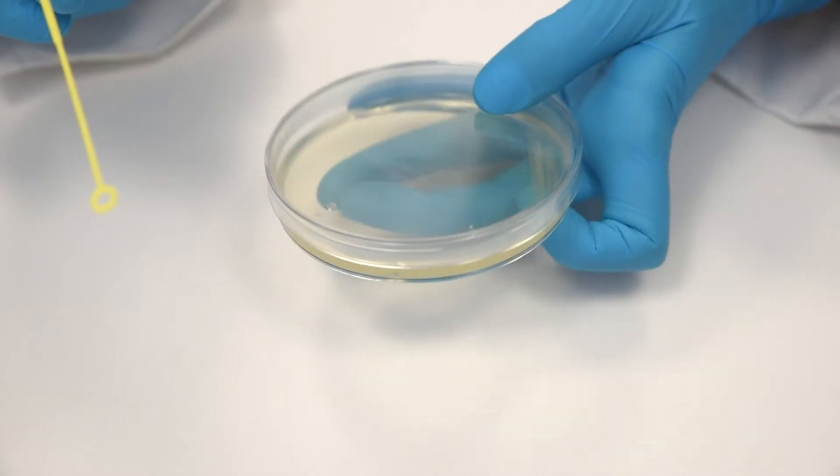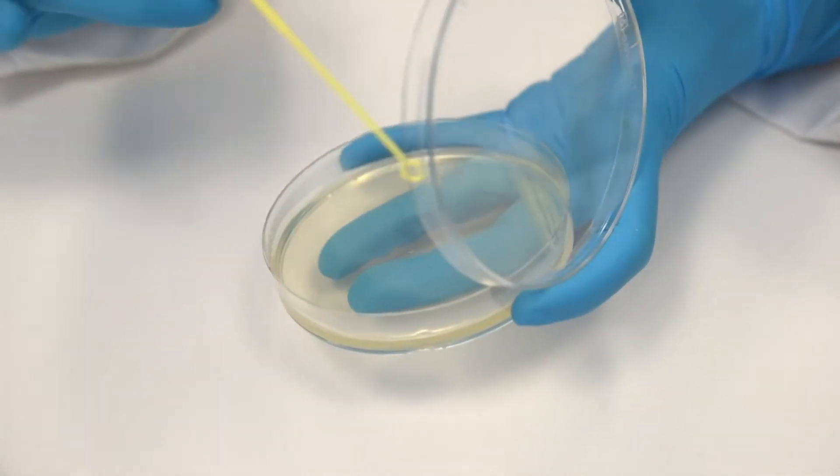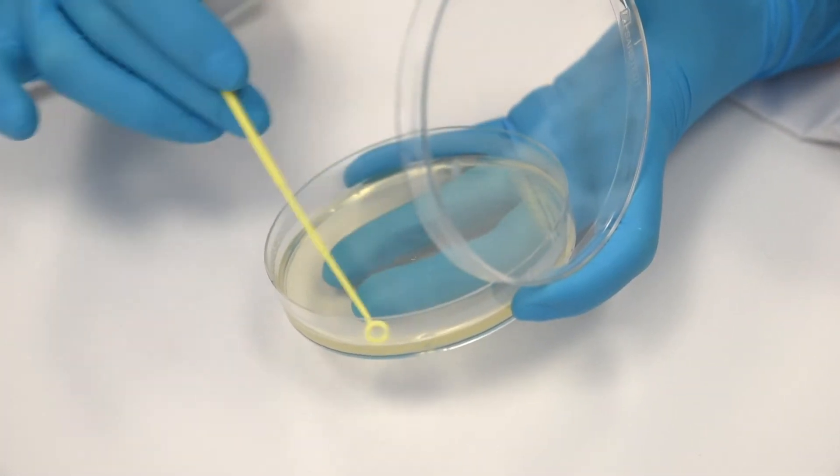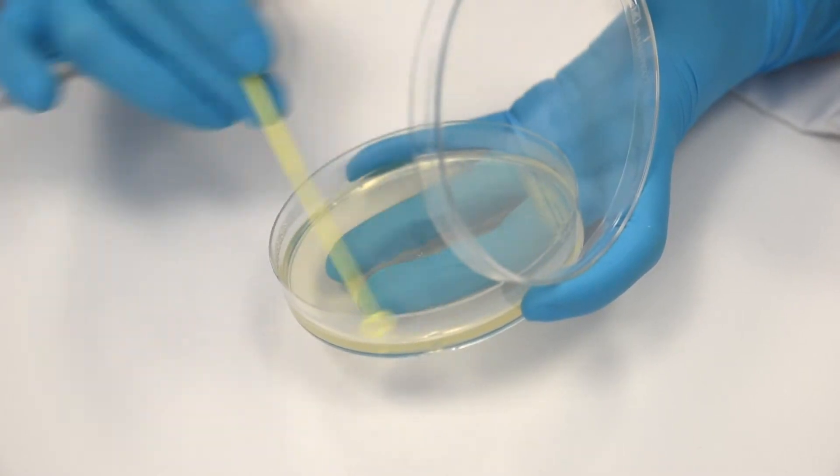Step 4: With the same loop, streak through the primary streak to a clean part of the agar several times to create a secondary streak.